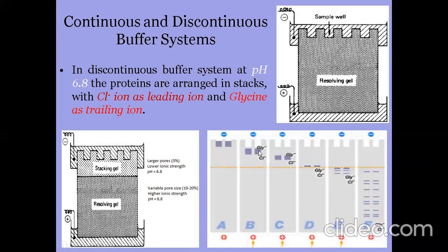And with that the proteins or the macromolecules will move. When they move together, they will move beyond the protein molecules.